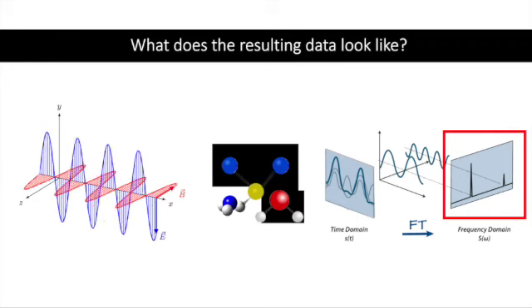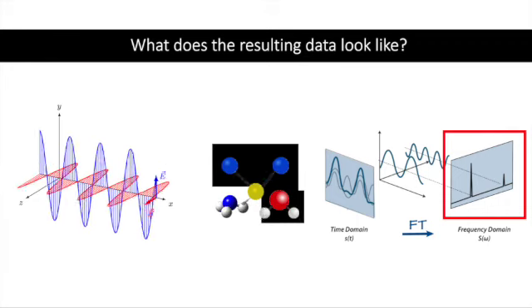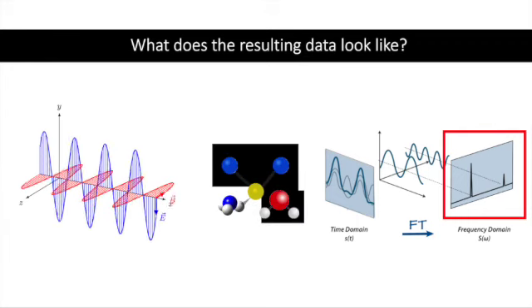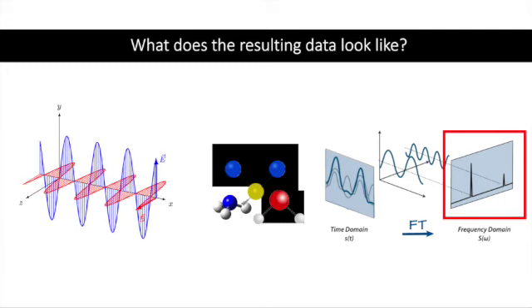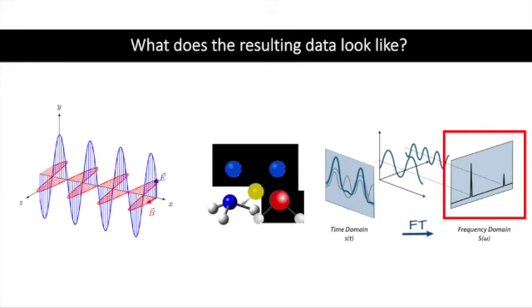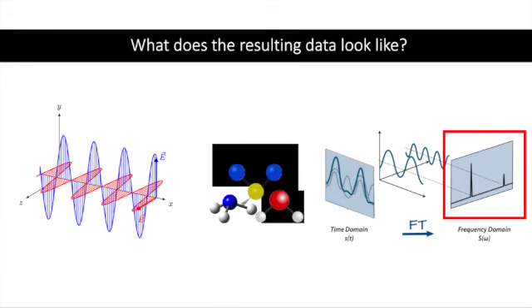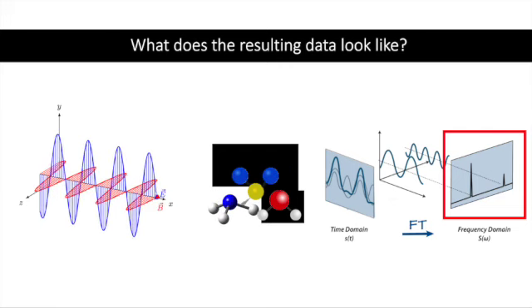This signal can be transformed, so instead of having the time domain, we can look at the frequency domain. In the case of light or infrared, we are concerned with the wavelength, and as you may know, the inverse of frequency is wavelength. And with that, we can observe peaks on this wavelength absorbance curve. So this will help us view the abundance or presence of a certain molecule that absorbs light at a specific wavelength.